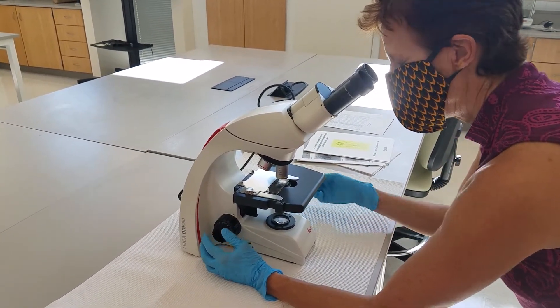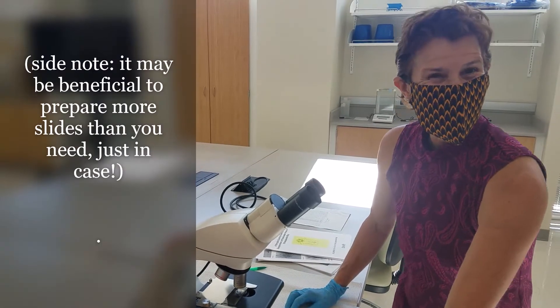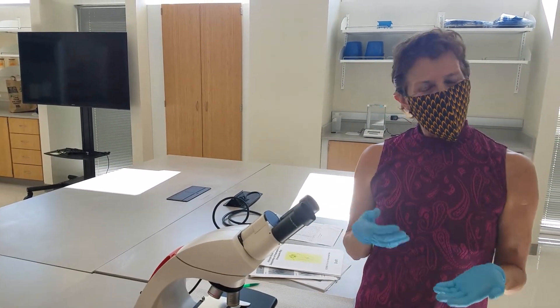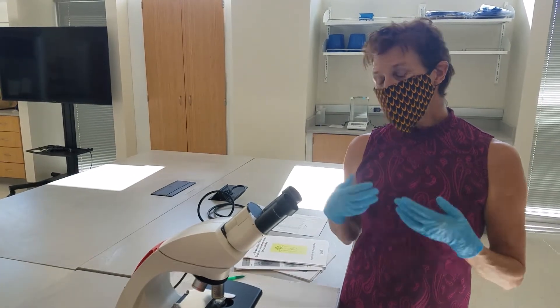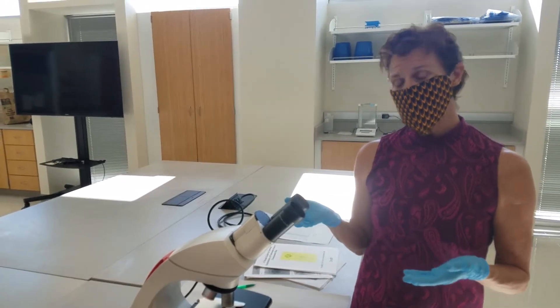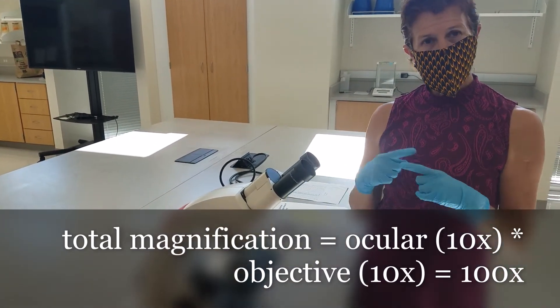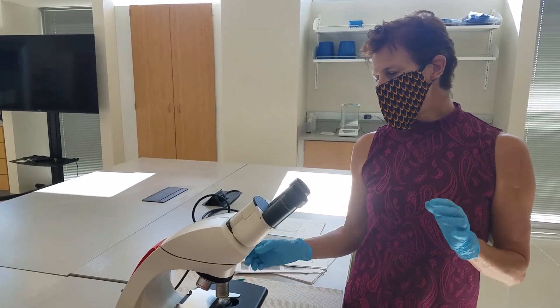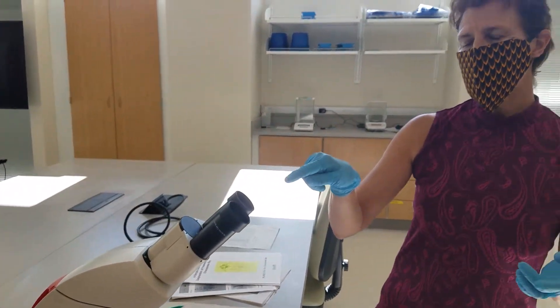I saw a nauplius. By the time you're watching this procedure, you will have had the lecture on zooplankton, so you will know what copepods are. Nauplii are the baby copepods that go through six molts. Because copepods and nauplii are reasonably large, I was able to see that's what this was even at 4X. At 100X — that's 10X here and 10X on the ocular, making a multiplier of 10 times 10 — so you have 100X magnification total. I only had to zoom in just a little bit to get a good magnification on a nauplius.